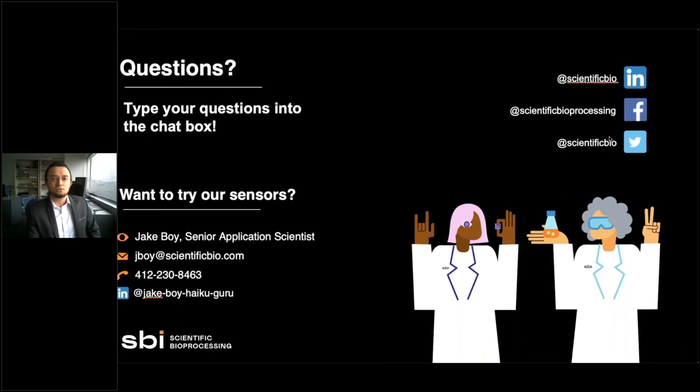That's true. Let me also add something. I'm sorry, I know that I talk too much about these things, but I really like them. I listened to this researcher the other day, and they were trying a very interesting approach in which they had microspheres with fluorescent dye, which they could use to measure oxygen by fluorescence quenching. They had an initial small spheroid, then they would add microspheres to that spheroid. The microspheres would stick to the surface of the spheroid, and then they would add an extra layer of cells.